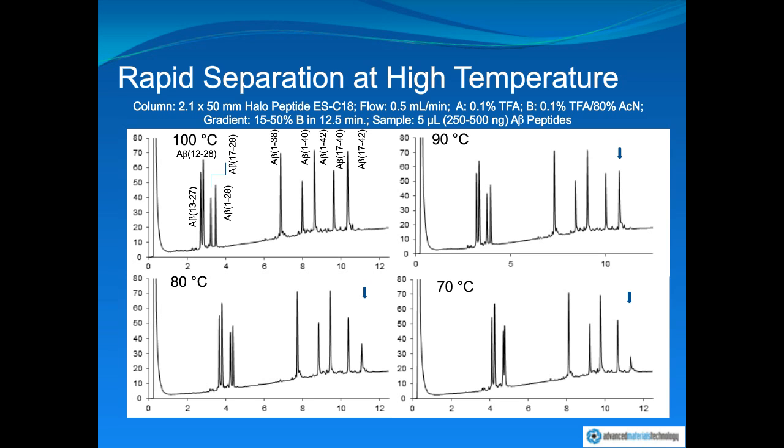And the use of these aggressive conditions must be considered in the design of appropriate chromatographic materials.